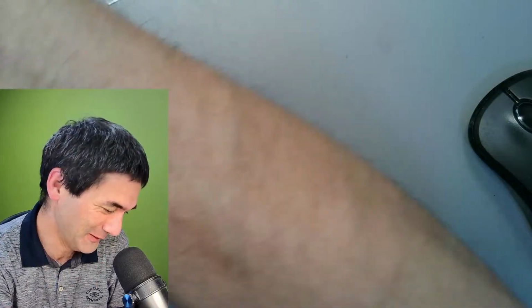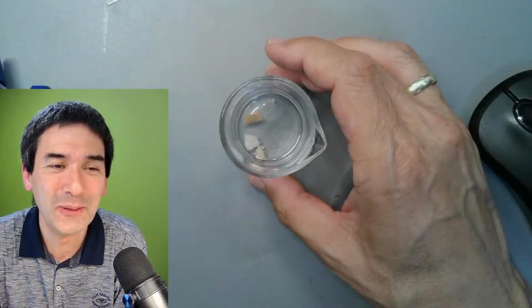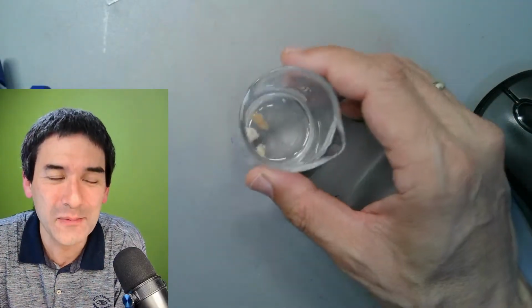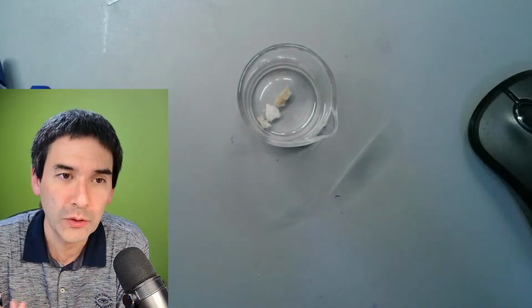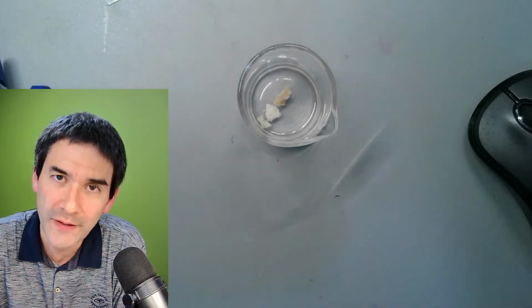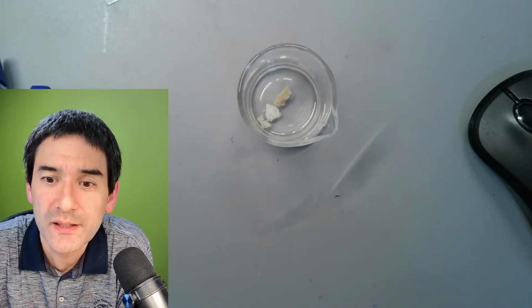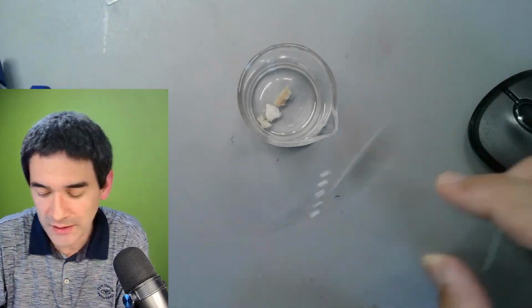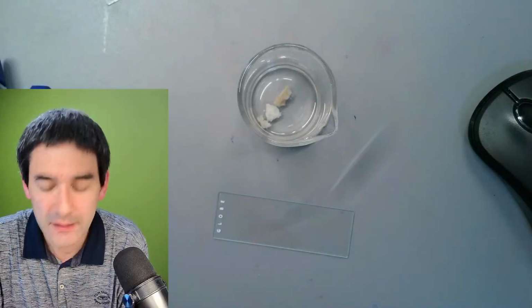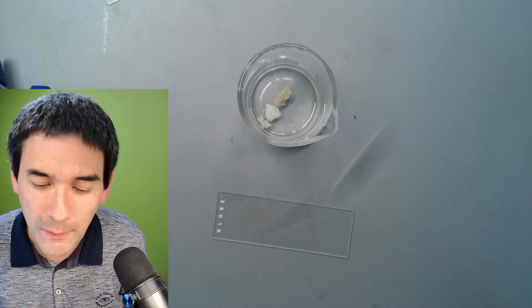I know. It's because sometimes I collect specimens, I don't label them, and then I forget what it actually is. So what I've done now is I've taken some samples here and put them into water. The water will remove the alcohol and rehydrate this. Let's try to find something interesting here, because I know that I did this a few years ago, and I found something in there that was worth discussing a little bit. And I hope I'm able to find it again.